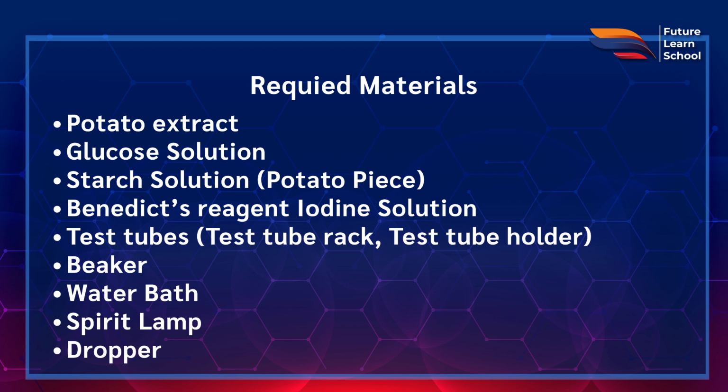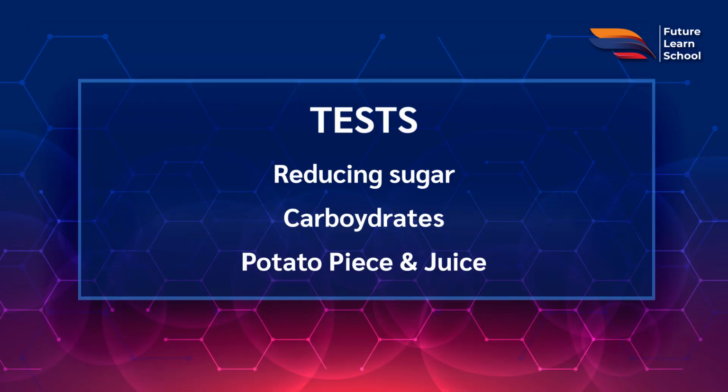So in order to confirm whether carbohydrates are present in the solution or not, we have to perform the Molisch test, and if the result for the Molisch test is positive, it means carbohydrates are present in our solution. Then in the next step, we have to perform 2 to 3 different reactions in order to confirm what kind of carbohydrates are present.